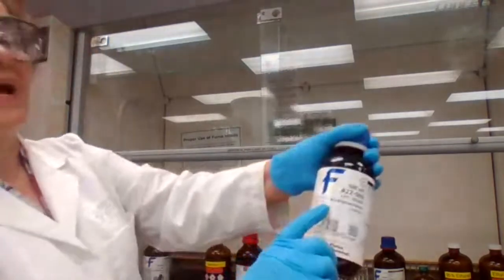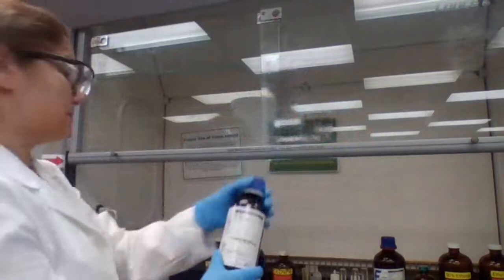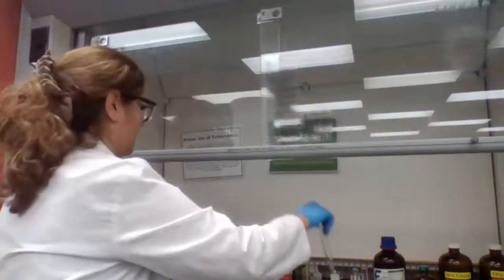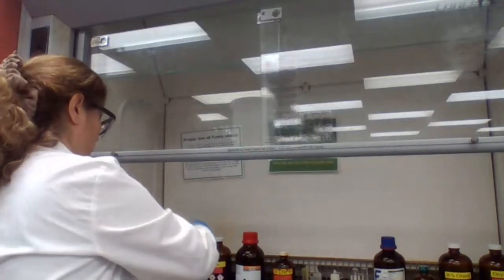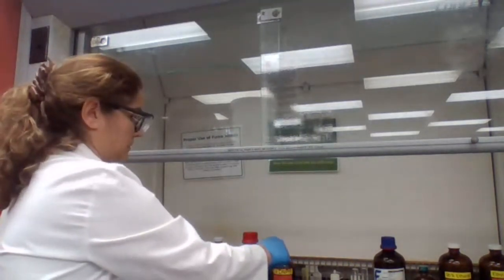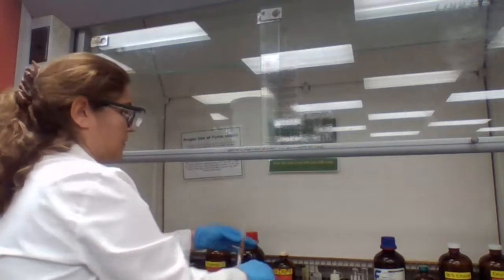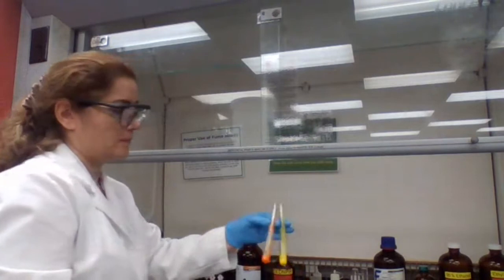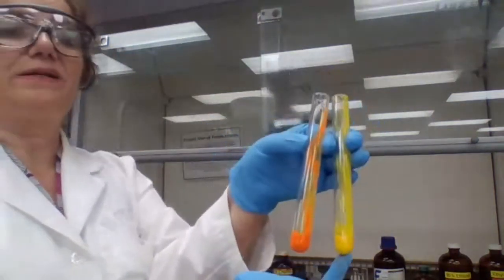Next one is acetophenone. I'm going to use the acetophenone as my next sample. That's acetophenone, and that's cyclohexanone.